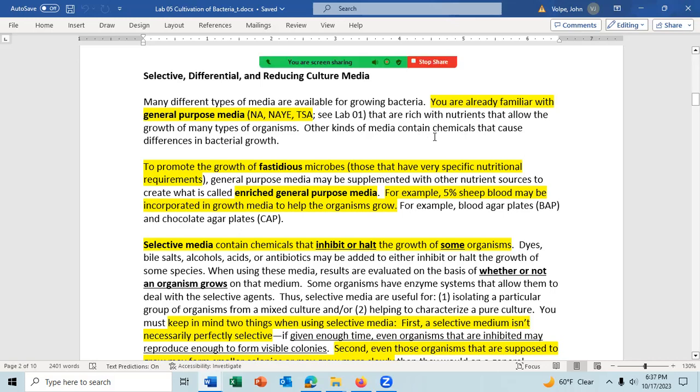In microbiology, if you were to come into the lab, I could show you a textbook that's actually a little bit bigger than this here, a little bit wider, maybe a little bit longer, and it's about this thick. On each page of this book, there is one media.